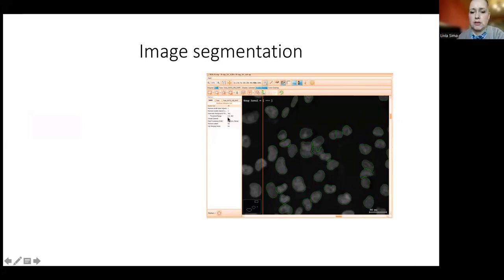You should choose this region of interest, taking into account that the sample is heterogeneous, and within this smaller region you have to have nuclei that have high intensity, as well as nuclei with low intensity, to capture all the diversity in your sample.